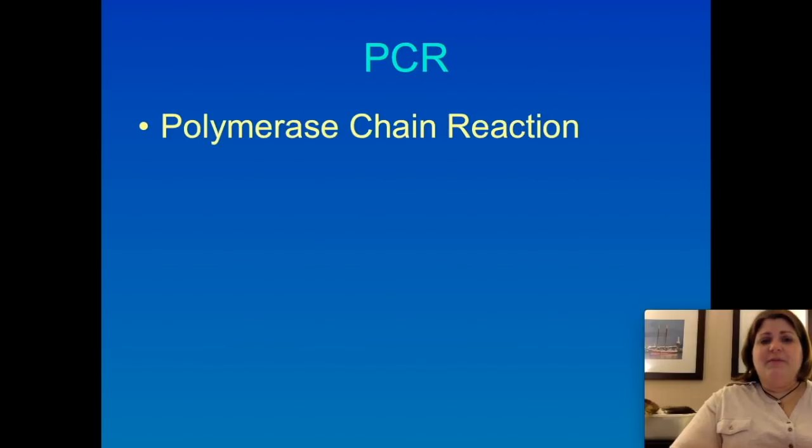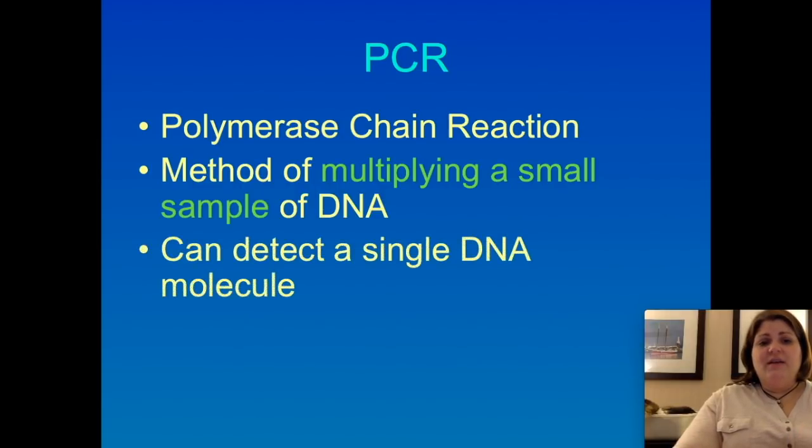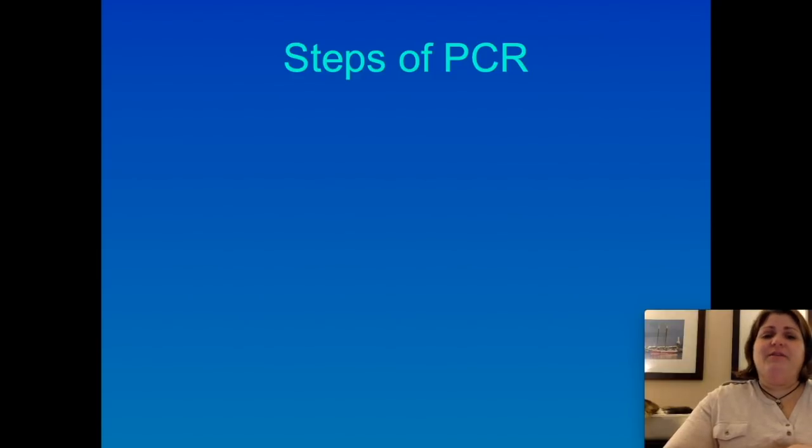So PCR stands for polymerase chain reaction, and it's basically a way of taking a small sample of DNA and increasing the quantity so that there can be lots of DNA. The steps of PCR are actually pretty straightforward.